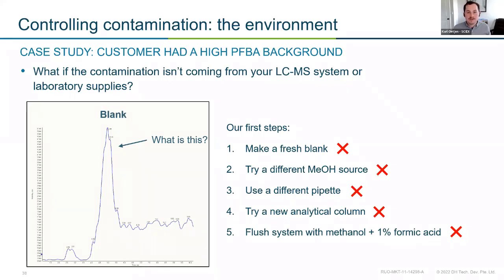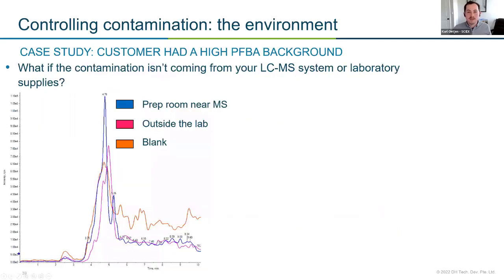So we wanted to take a different approach, and we said, okay, let's look in our environment. Where could this be coming from? It wasn't here before. Let's do some simple methanol swipes around the room and see if we can narrow this down. We took a methanol swipe of the prep room, saw a bigger peak, but still within the range of what we're seeing in the instrument room, just outside the lab. So actually in the break room, maybe somehow something's coming from there. Maybe they waxed the floors, for example, and it's causing our higher background. And then we ran the same blank, and we saw, okay, that's not really where it's coming from.